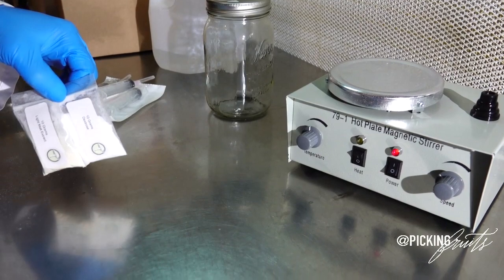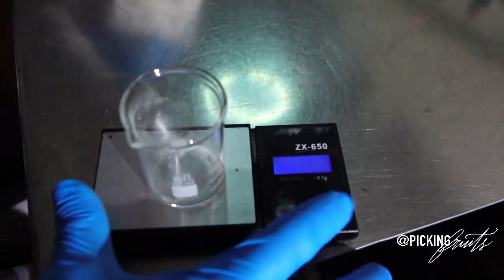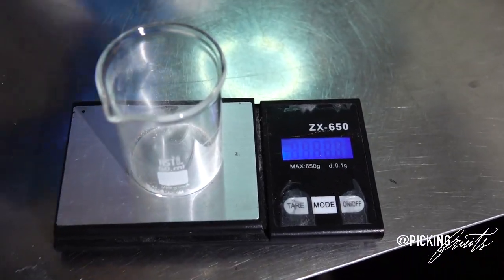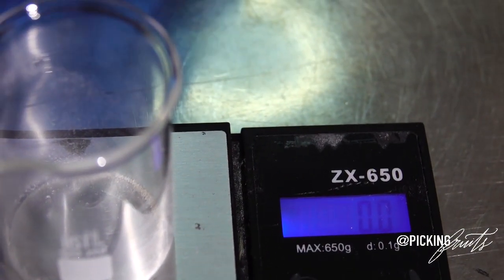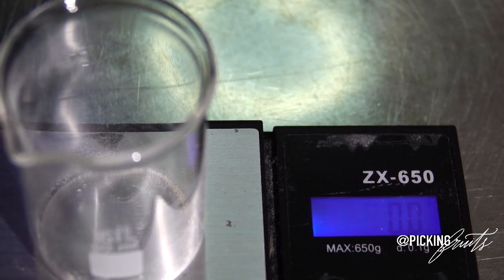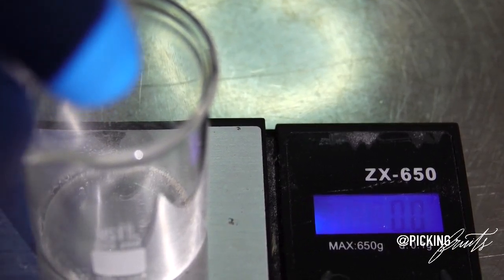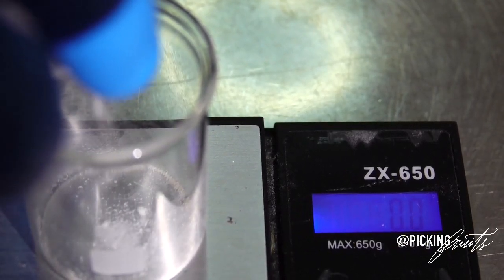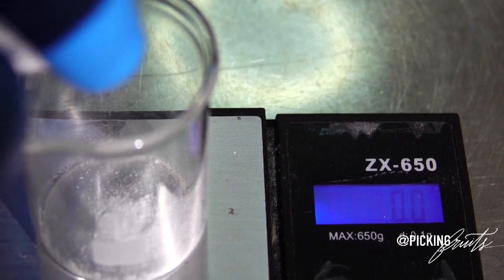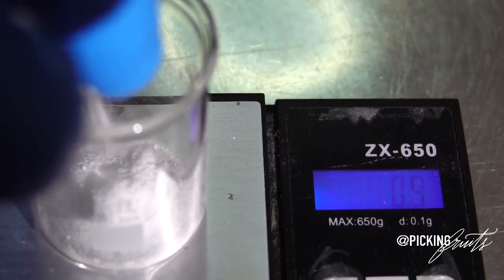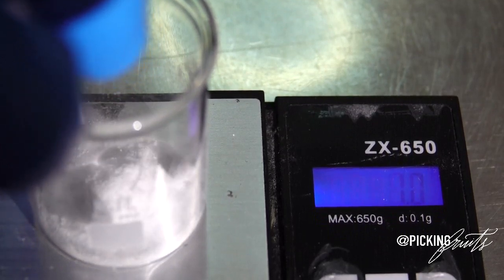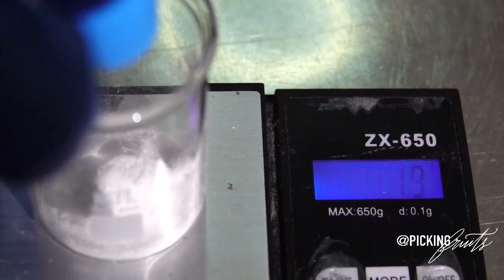So using our scale, we will make sure that our vessel is tared out. And we're going to be measuring 2.5 grams of each of our nutrients. So first I will add 2.5 grams of our dextrose. And if you don't know, dextrose is pretty much corn sugar that is somewhat isolated.